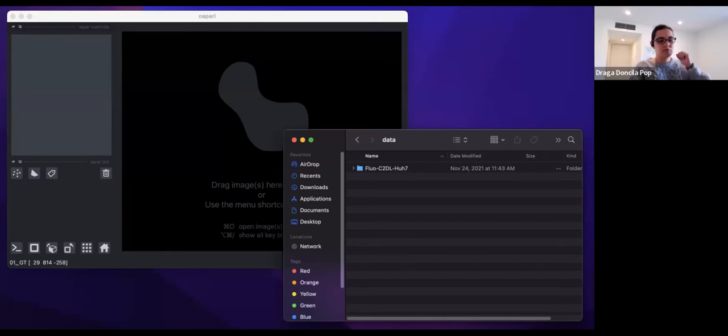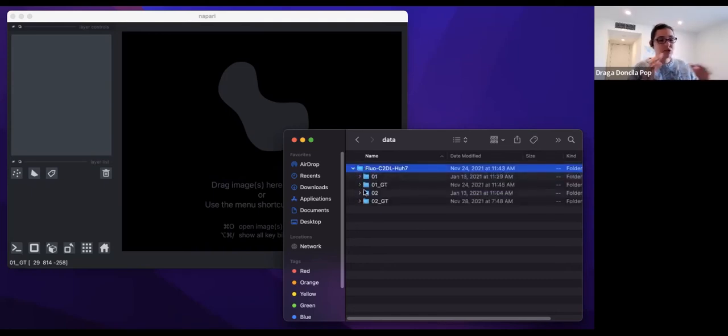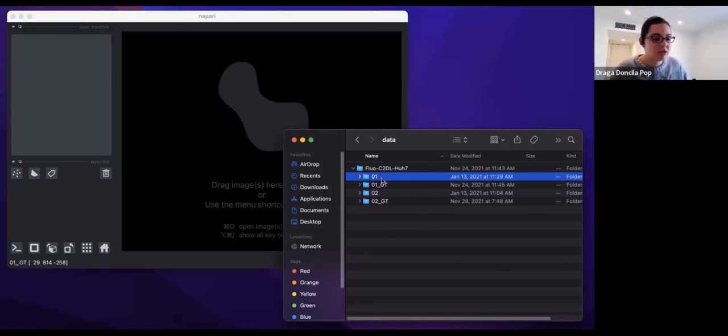Okay, our goal: participate in the tracking challenge, build a plugin that can read the tracking challenge data and the ground truth that is provided with it, and then do a little segmentation on it and compare that against the ground truth, and then save all of that back out. So I've downloaded some of the tracking challenge data, and that's in this folder here. And there's two data sets in there, and we've got ground truth, so GT for ground truth, and then just like the volume itself for each data set.